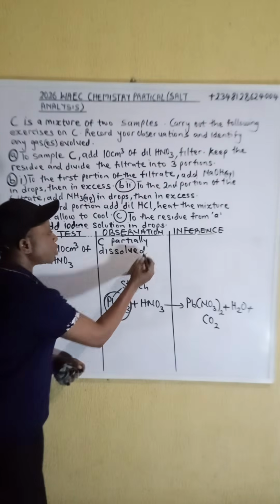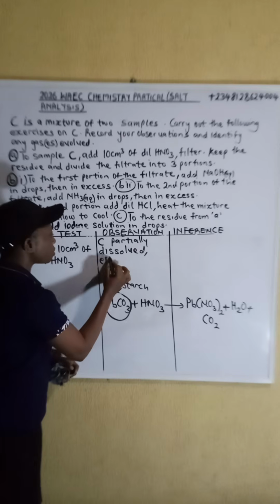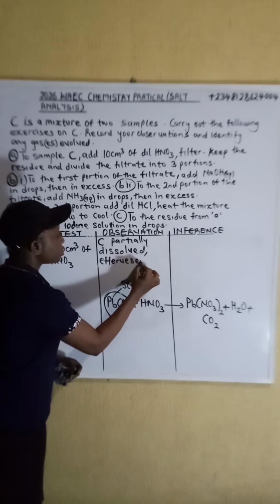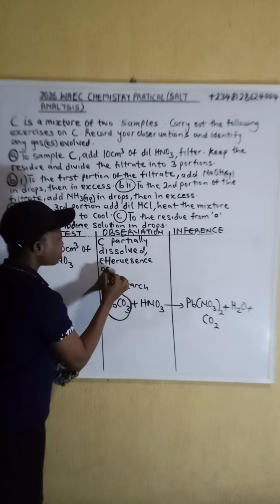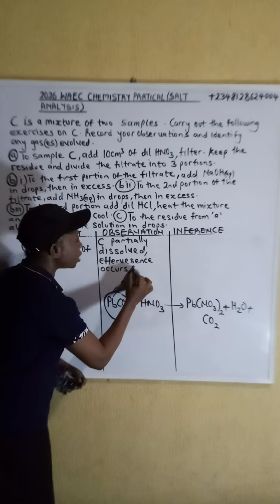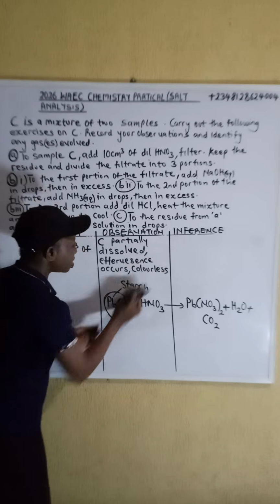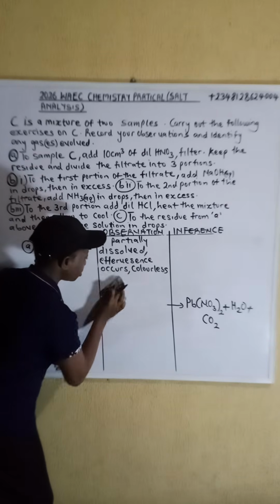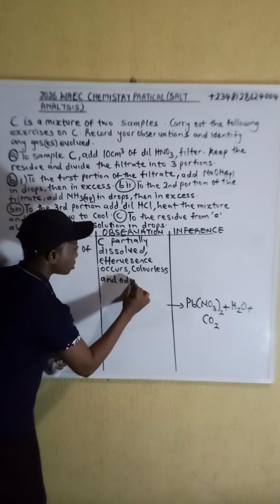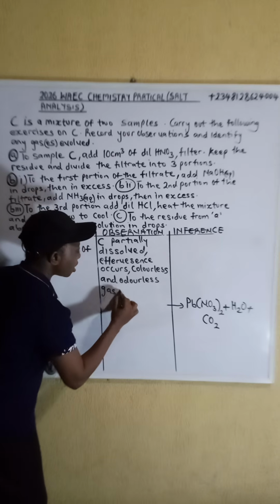So effervescence occurs. Then colorless and odorless gas evolved.